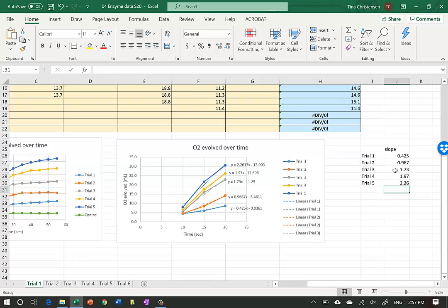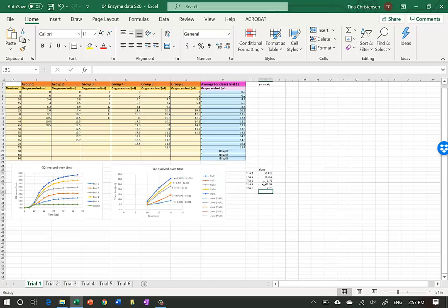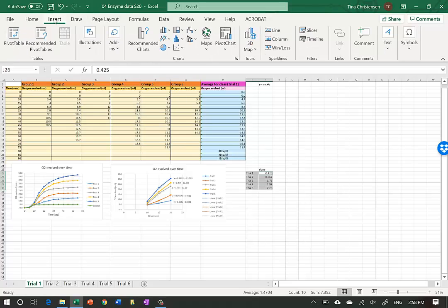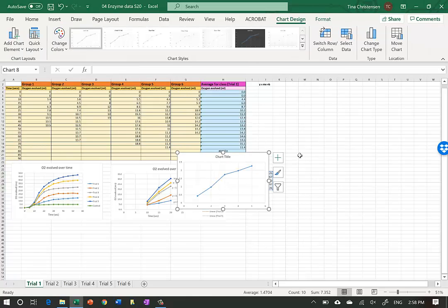Now I can make the next graph - graphing the reaction rates to show how they increase with concentration. Trial 1 had low concentration and Trial 5 had high concentration. I highlight the trial names, hold Ctrl to also highlight the slope values, go to Insert, and do an XY scatter plot with connected dots.